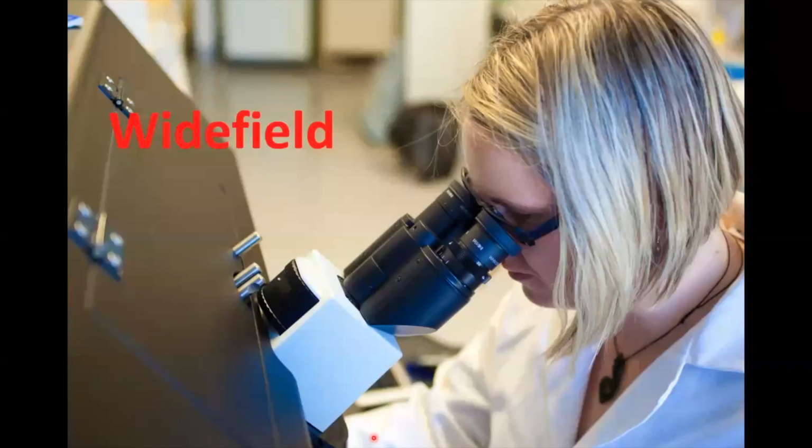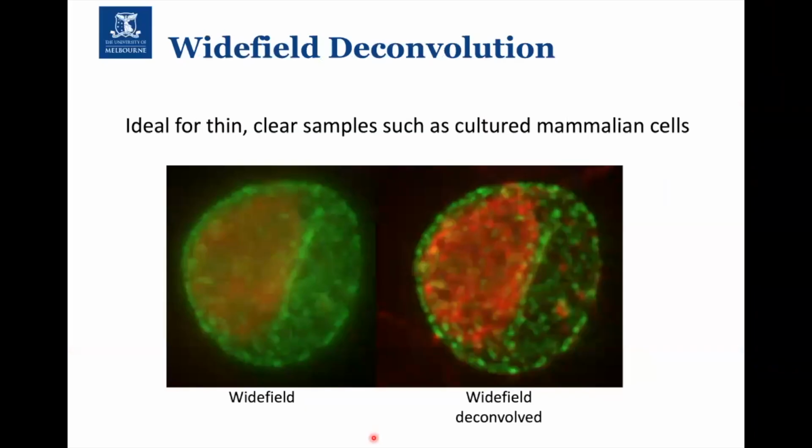Okay, back to Widefield. So we've already discussed this a little bit, but I wanted to add in an extra layer. As we mentioned when we were comparing Widefield and Confocal, in Widefield you're illuminating the full field of view, and you're not getting that nice clean optical section that you are on a confocal microscope. But we can create confocal-like images from Widefield data, and we do that using a method called deconvolution.